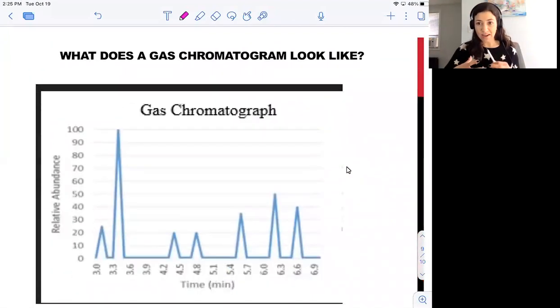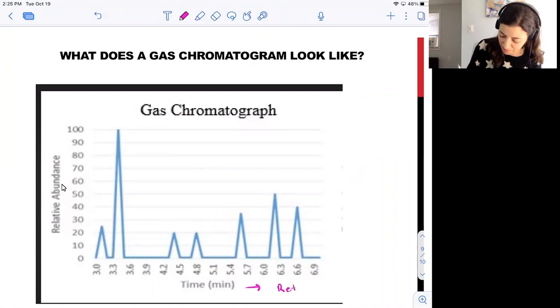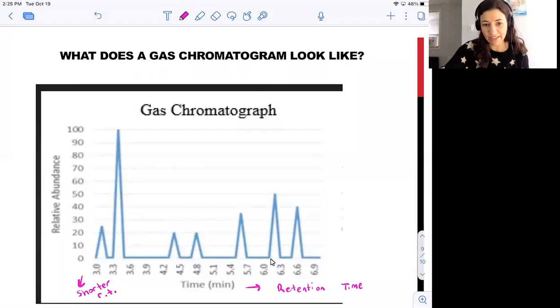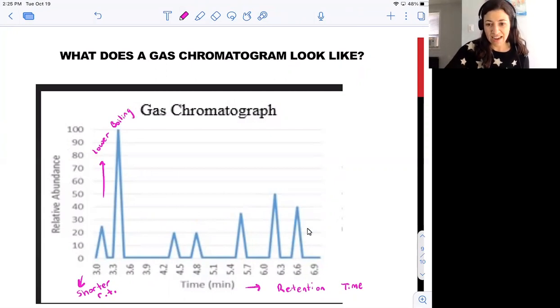Let's take a look at what the data from both the gas chromatography and the mass spectrometry portion of the experiment should look like. First, let's take a look at a gas chromatogram. You'll find on the y-axis that we're looking at relative abundance. This is basically a count, how many molecules came out at each time point. The x-axis is known as retention time. The shorter retention time is towards the left hand of the spectrum. A higher or longer retention time is at the right. A lower boiling compound would be on this side of the chromatogram. Those that are coming out closer to six and a half and seven minutes will have a relatively higher boiling point.